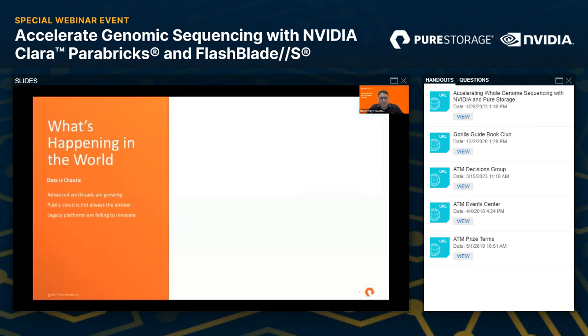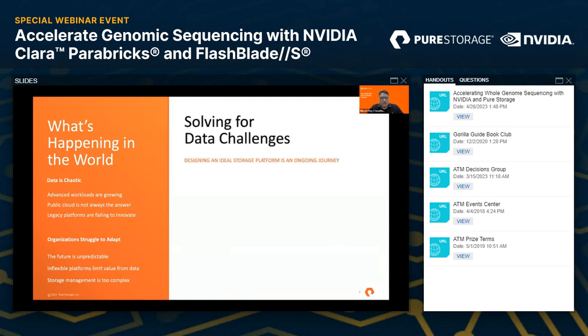That means data has gravity. When you're doing it in local storage, when you're having a small number of samples, just like what you heard in the previous part of the presentation, this all looks great, but things start to change when you have a high magnitude of samples that need to be processed. And that is where it becomes extremely challenging, not only effective I/O that goes back and forth from the computational platform to the backend storage.